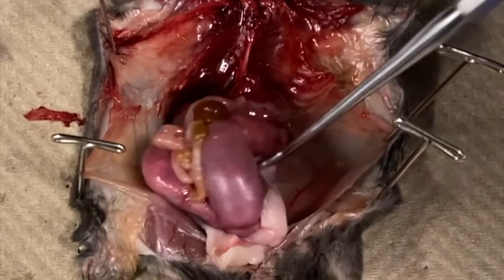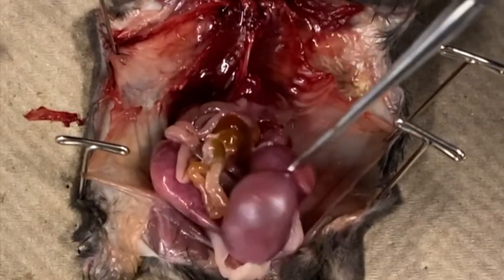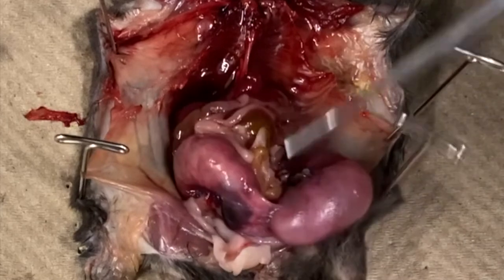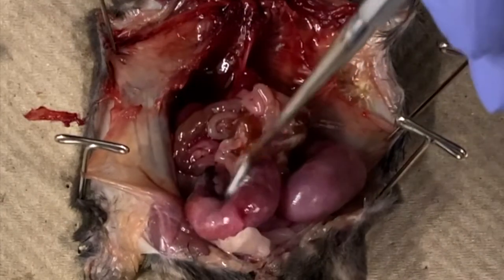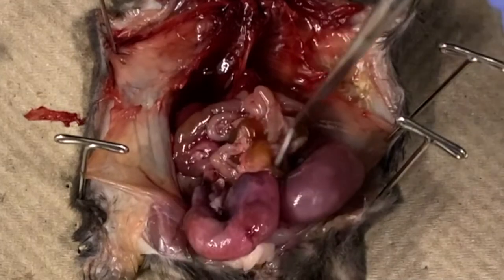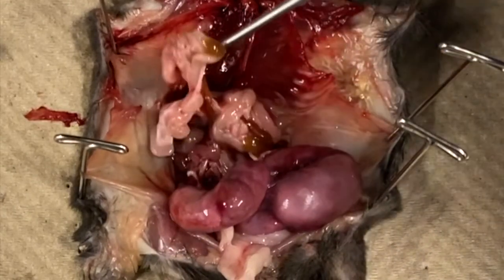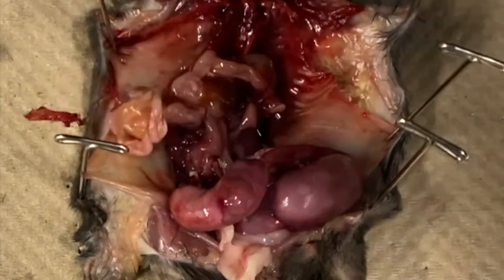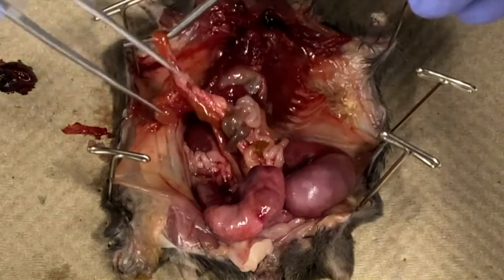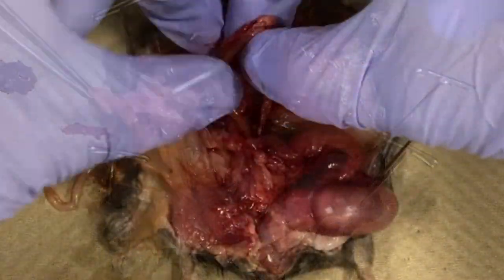You may notice in this mouse that much of the digestive system is blocked from view. That is because this mouse is pregnant, and what you are looking at is the uterus full of embryos. Let's move the uterus out of the way to allow a better view of the digestive tract. The small intestine is tightly coiled and held together by a thin sheet of connective tissue called mesentery. You can unwind the intestine by gently pulling and breaking apart the mesentery using a probe or your fingers.